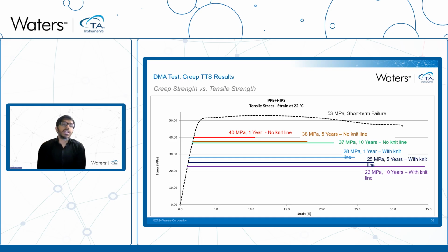Now we will take a look at the creep data and make a comparison from a different perspective, which is in terms of total duration or total lifetime. Here, when we compare in terms of a 1-year lifetime, the material with no knit line, which had no defect, can survive or withstand 40 megapascal of consistent stress. And that stress level is reduced to only 28 megapascal with the material with knit line or with the defect.